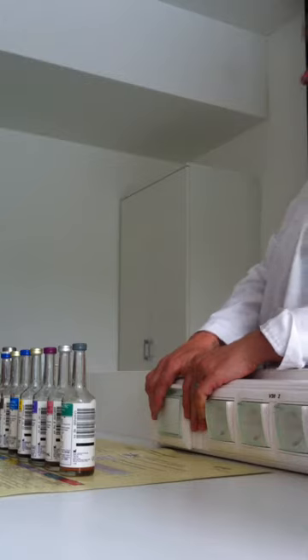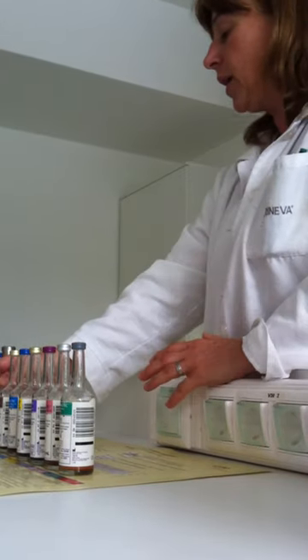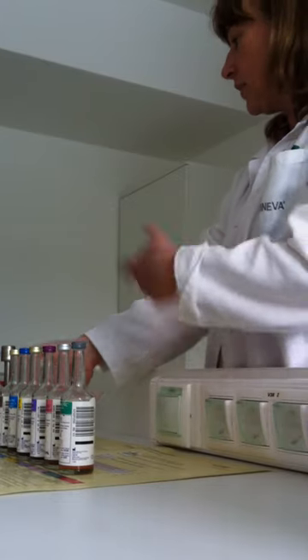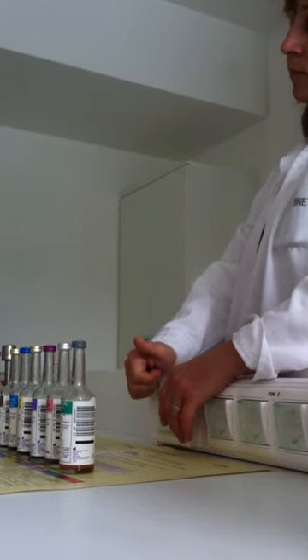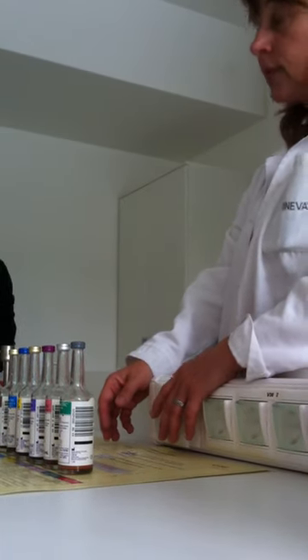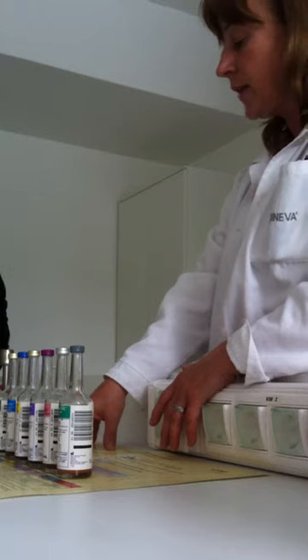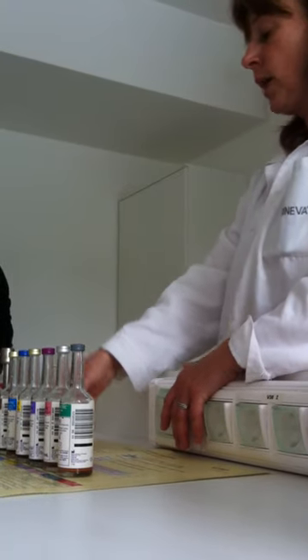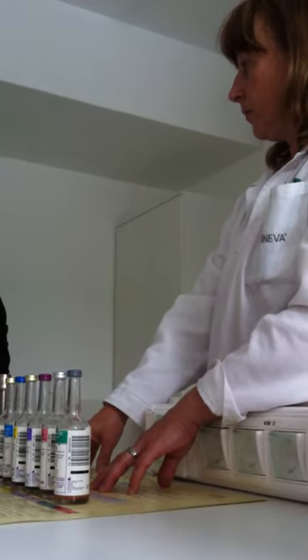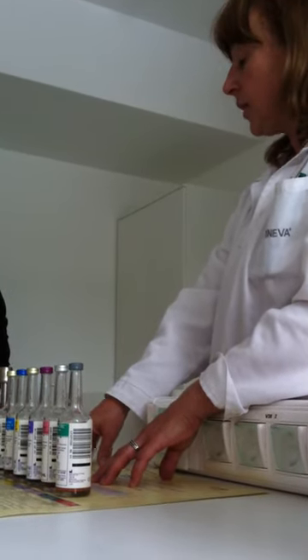According to the staining, we can make a disc diffusion test, and next day we will see which bacterium grows. Disc diffusion, is that the Kirby-Bauer test? Yes, Kirby-Bauer test. So next day we can tell the name of the bacterium, and we can tell the antibiotic resistance pattern. So the alarm is because you don't have to check every bottle. Yes.